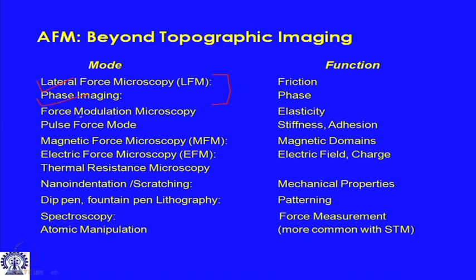Then we will talk a little bit about force modulation microscopy, which requires an additional pulsation or oscillation during contact mode. This is distinct from tapping mode or non-contact mode, and it gives information about the local elastic property of a surface. We will not talk about the pulse force mode. This is some sort of an extension of force modulation microscopy.